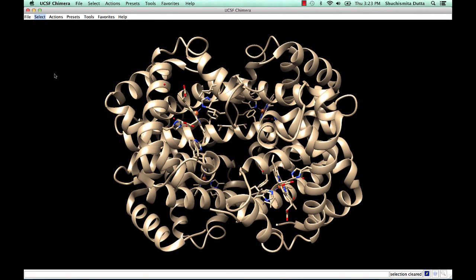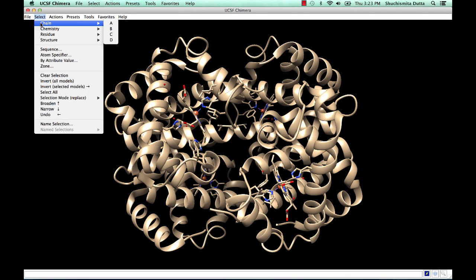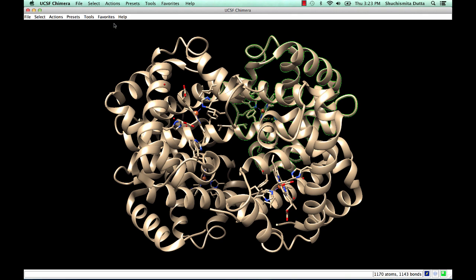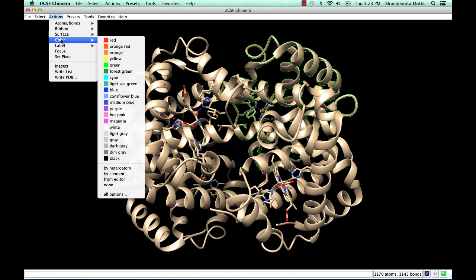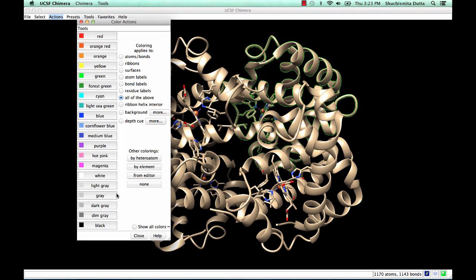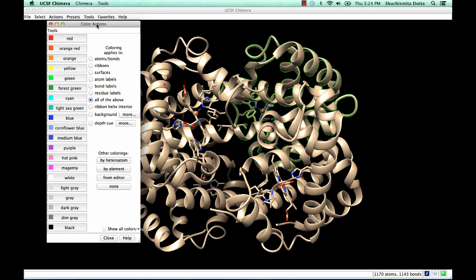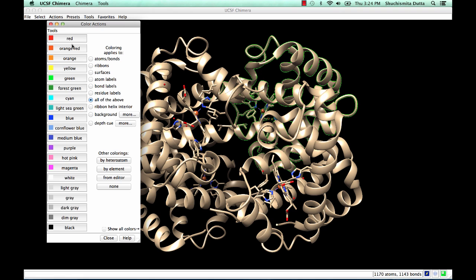In the next part, we will color chain A in red. For that, we select chain A, go to the Actions menu, and pull up all the options for color. Notice that the Coloring Applies to option has various choices. You can either selectively color the ribbons, surfaces, atom labels, bond labels, or apply a color to all of the above.